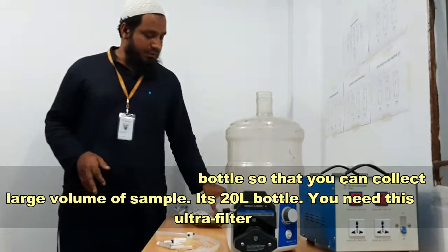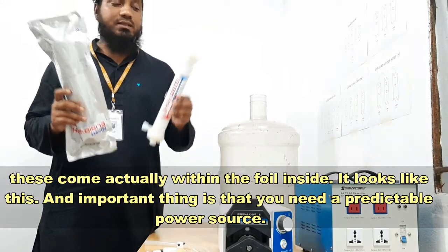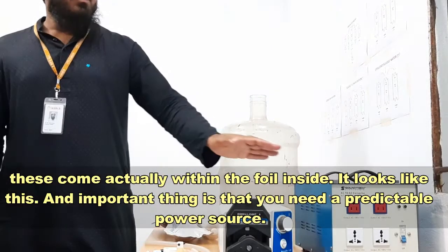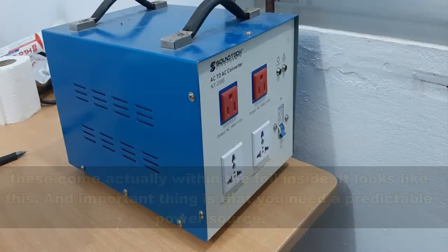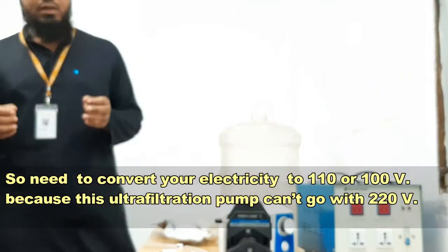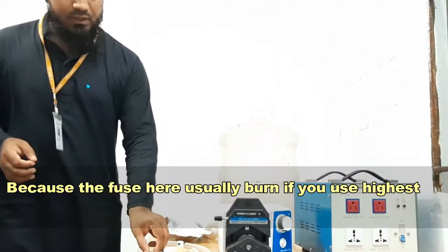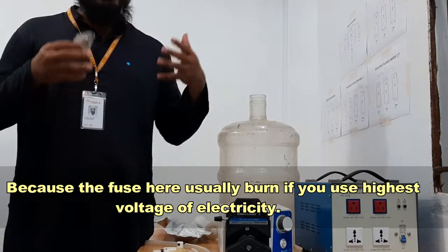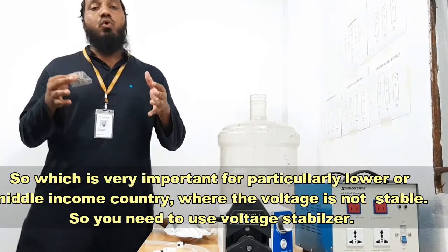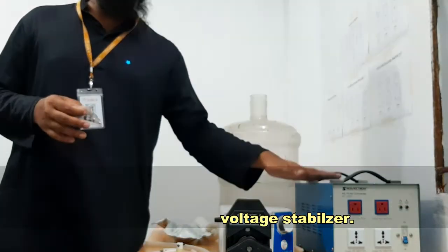You need this ultra filter, which comes inside foil. An important thing is you need a reliable power source. You need to convert your electricity to 110 or 100 volts, because this ultrafiltration machine cannot run at 220V — the fuse here will usually burn if you use the highest voltage. This is very important particularly for low- and middle-income countries where electric voltage is not stable, so you need a voltage stabilizer and converter.